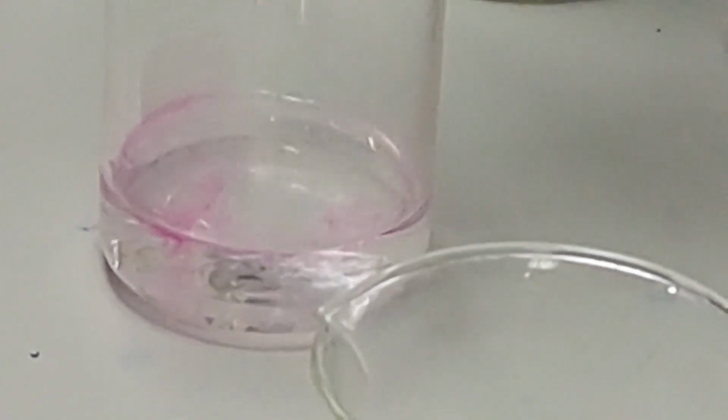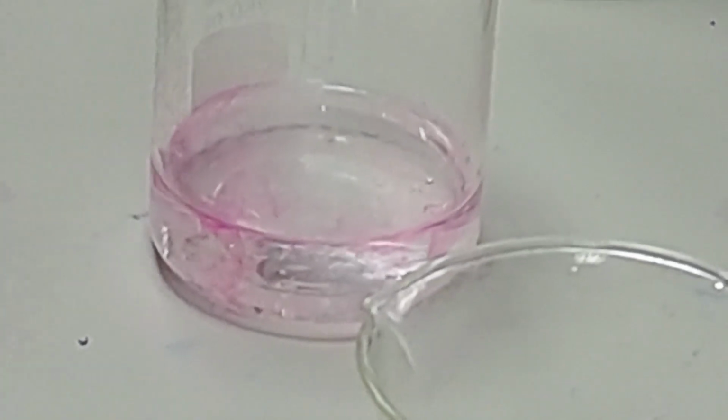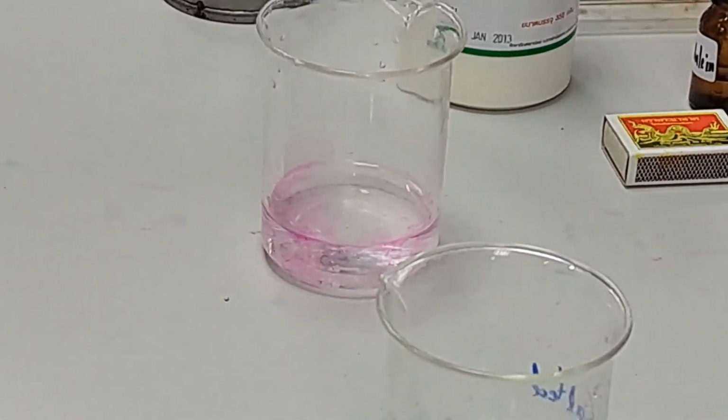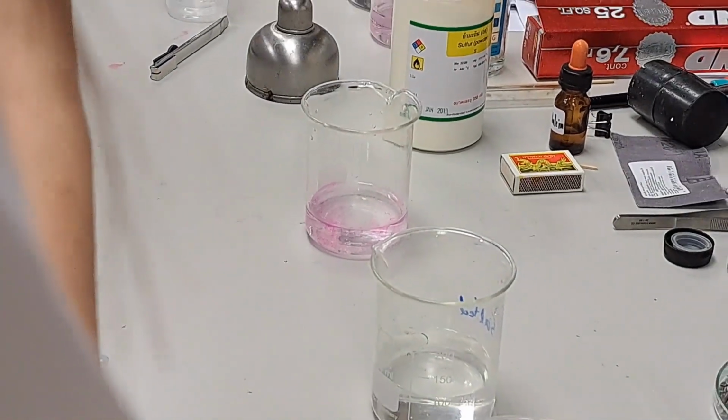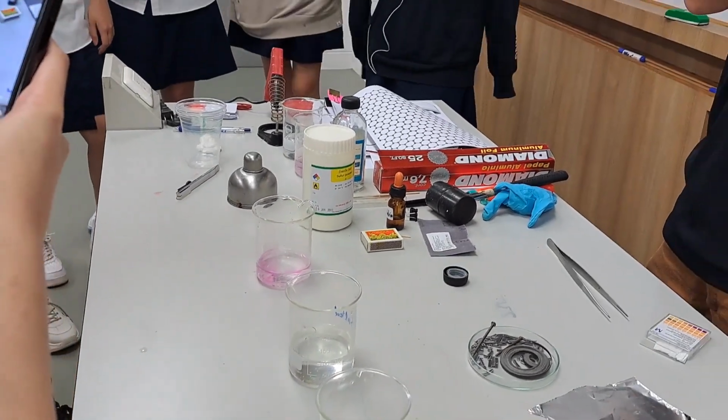And one more. Not that expensive. Yeah, sodium is not that reactive compared to the lower ones. And one more small piece.